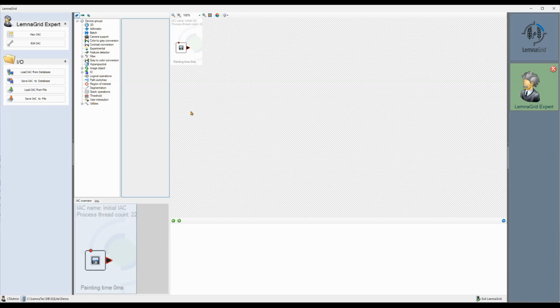Let's start with our first analysis. As a preparation, I have done a few steps outside this video. I selected some example images. These must be representative of what one expects to see with the experiment you want to analyze using this analysis. These example images should not be too few, but neither too many, as too many may slow down the development process too much. The number should range between 3 to about 10.